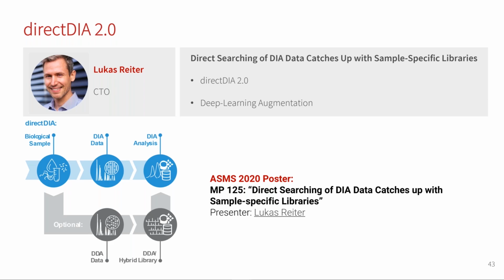Welcome everybody, and thank you very much, Oli, for the handover. I'm going to talk about DirectDIA 2.0 and how direct searching of DIA data caught up with using sample-specific libraries.